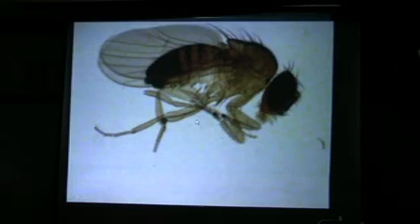What stage? Oh, the last one, guys. What is this? A fruit fly. A male fruit fly. What order? Diptera. It's a fly. And you write fruit fly as two separate words. Is that right? Not like butterfly. Butterfly, you write down as one word. Butterfly does not belong to Diptera.